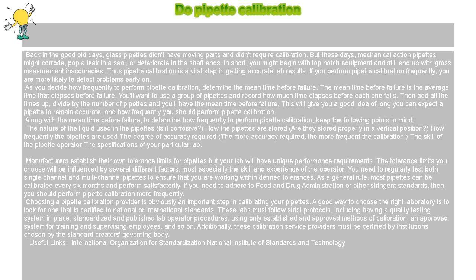This will give you a good idea of how long you can expect a pipette to remain accurate, and how frequently you should perform pipette calibration. Along with the mean time before failure, to determine how frequently to perform pipette calibration, keep the following points in mind. The nature of the liquid used in the pipettes.